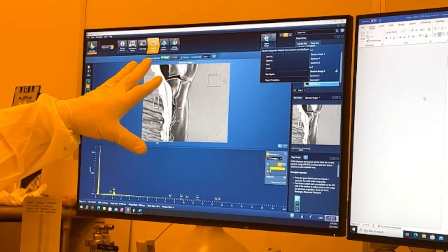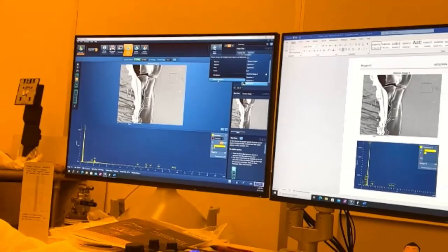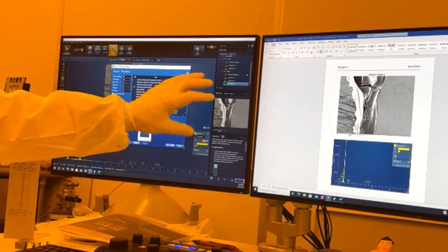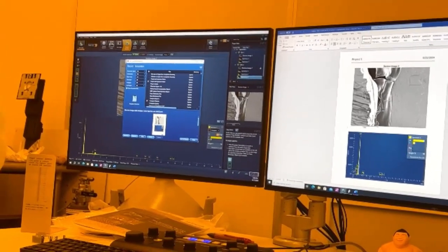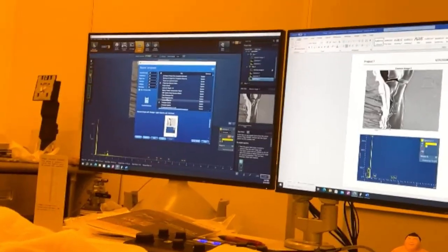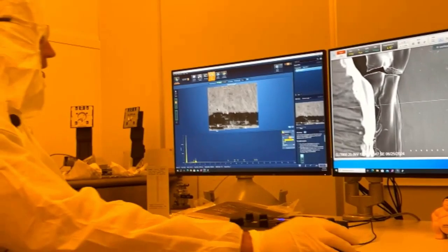So I'm just showing you guys the basics of this. There's different ways. You have to set up different templates, and then you can tell it to put out all the images with that spectrum. So that is point and ID.